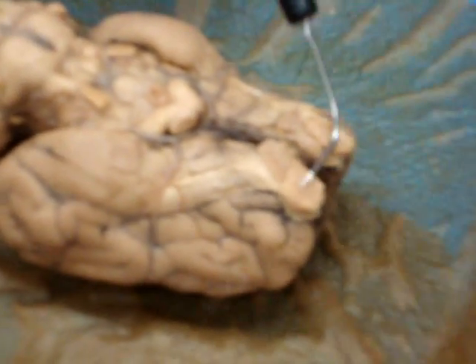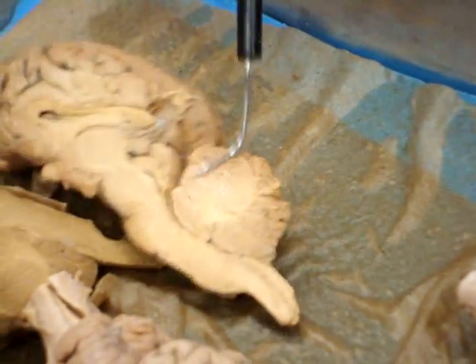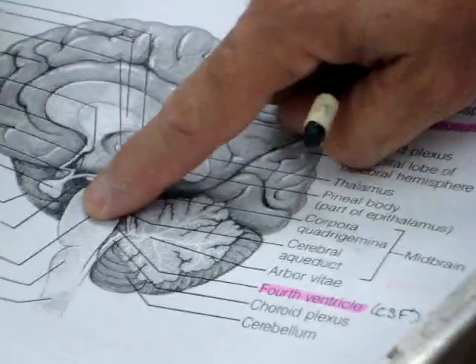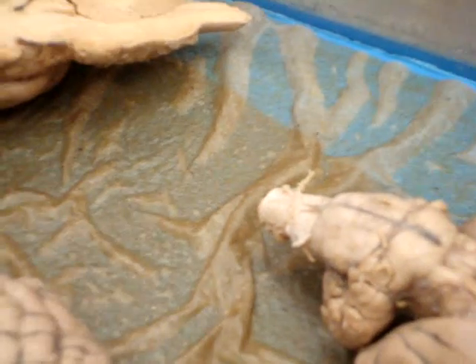These are the olfactory nerves over there. This bump here, this bump right there, they are all the same thing. What are they? They're the pons. Look at your diagram, okay? They are the pons. All right, what's beneath the pons? Medulla, right there. That's the pons, that's the medulla. What's at the very tip? Spinal cord, you got it.